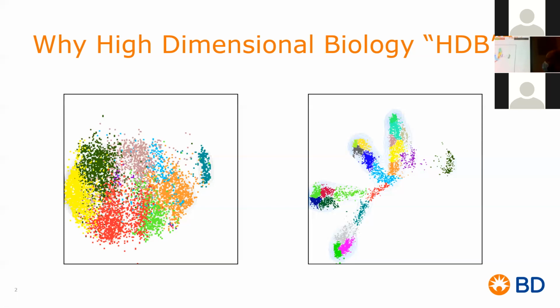However, when you incorporate protein, now you can see this new portion that I'm putting my cursor on that is exactly telling you how things are dividing and progressing through a trajectory, where the least activated is on the bottom left and the most activated is on the top right. So you can see the drastic change you are able to get from your data if you incorporate protein to your RNA sequencing data, or RNA sequencing data to your protein data. Otherwise, you're only getting half the story. And when you're doing the analysis, it looks completely different.